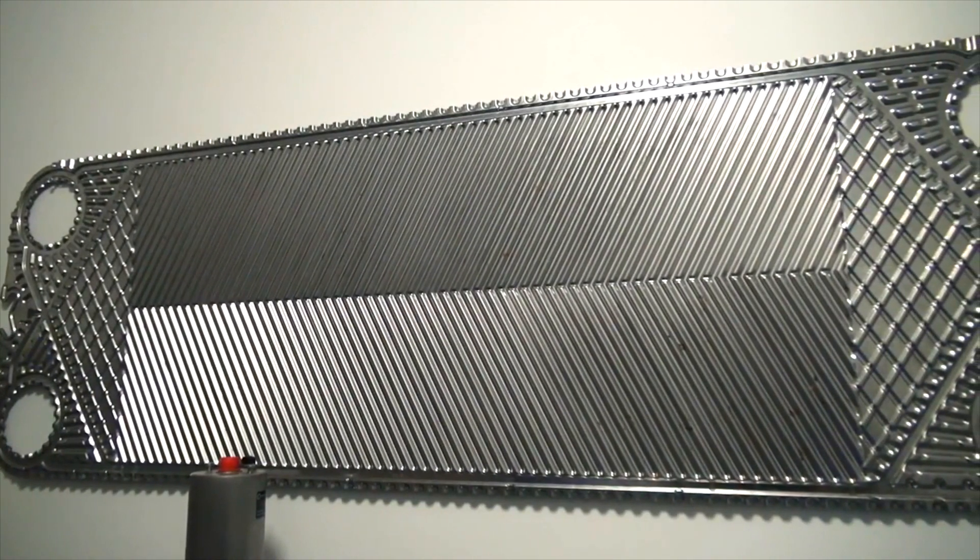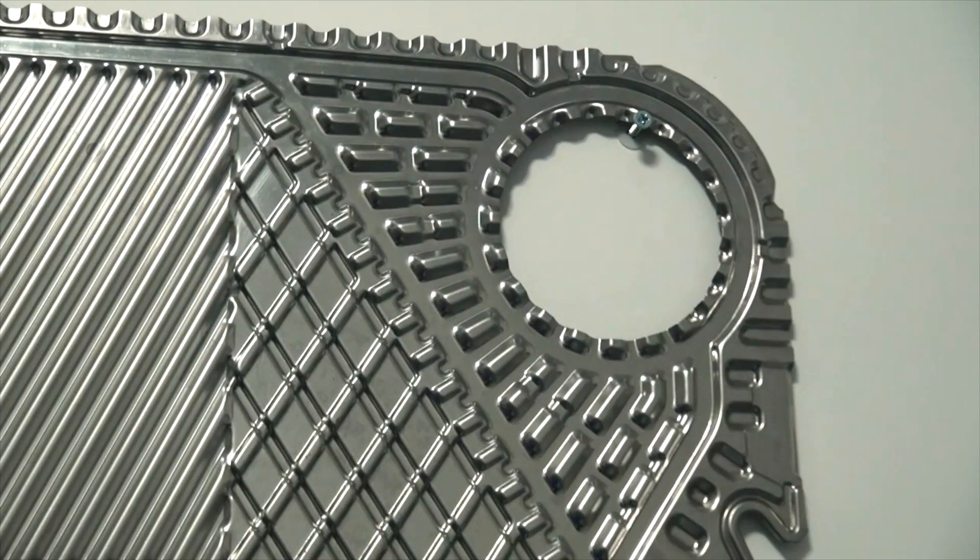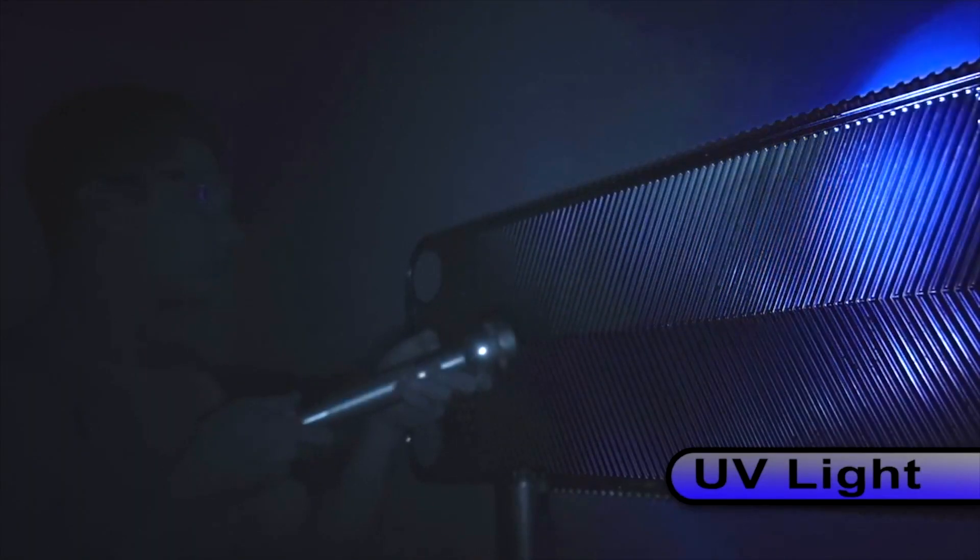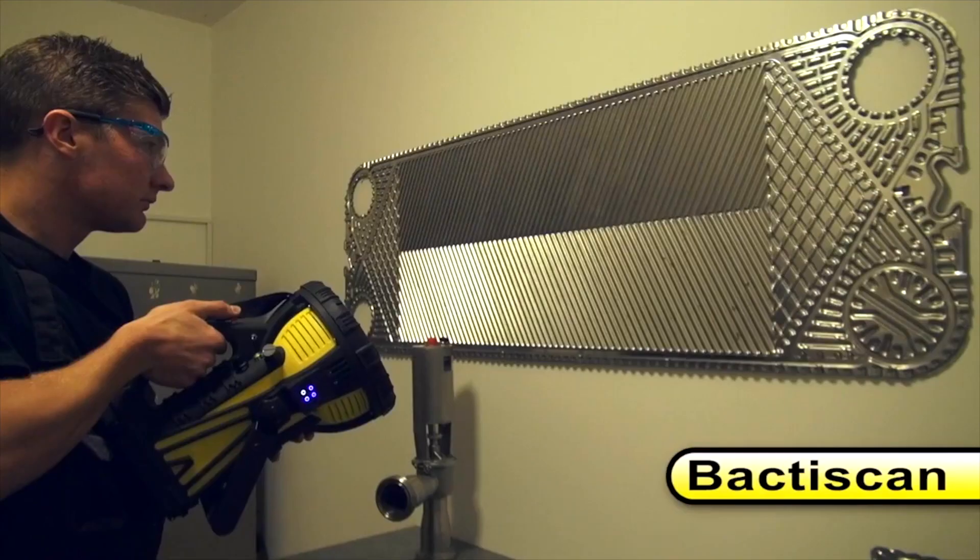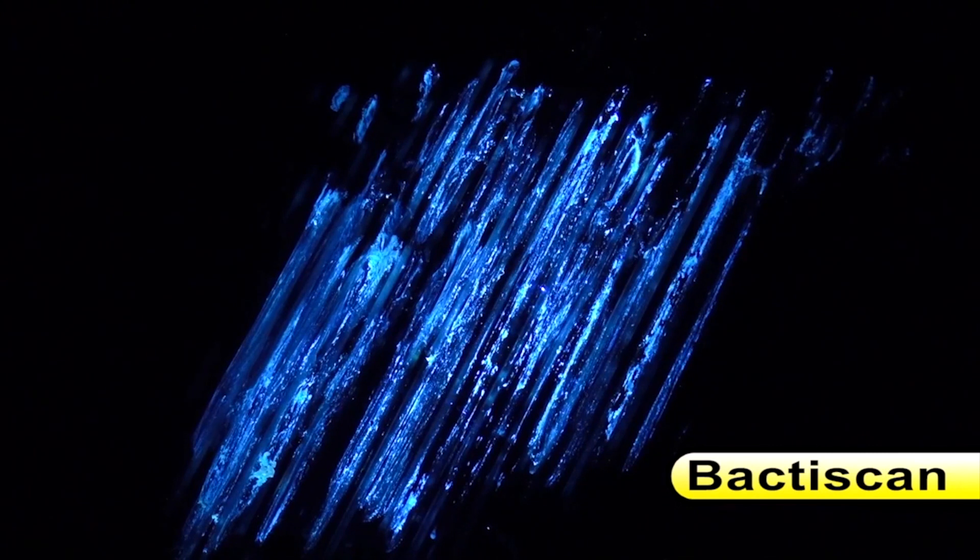These heat exchanger plates were removed from service and under white light they look clean. Under UV light again there is no evidence of bacteria or contamination, but when viewed with Bactiscan you can clearly see the proteins fluorescing before your eyes.